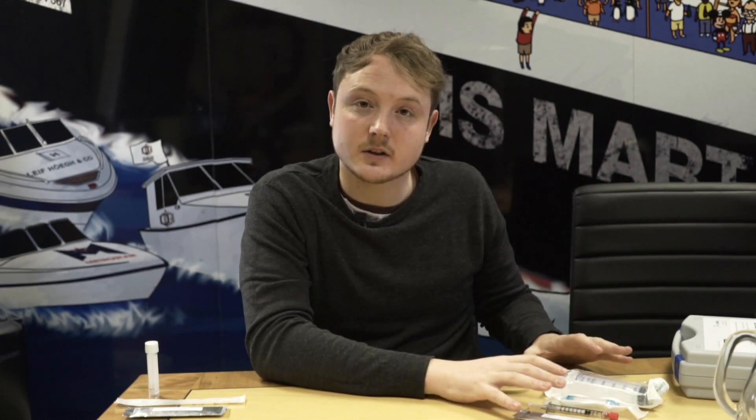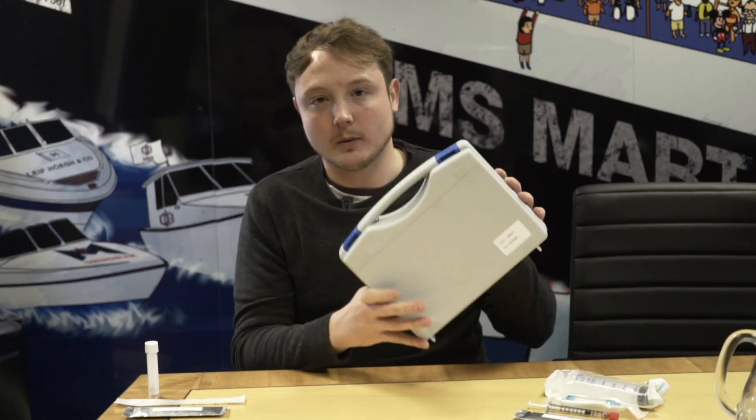Now a bit about the Legionella Max. Normally we would do these just as a single test, but this time we're going to bundle it all together for you. You're actually going to get two of the high-accuracy field tests and two of the high-accuracy biofilm tests, all in one box that you can keep on board.